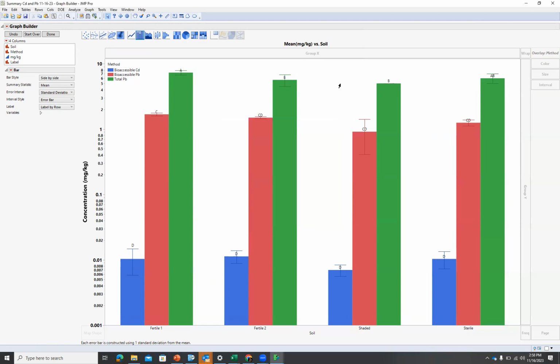You all good? All right. You want the y-axis to have all the numbers, as it'll make it look better. I don't like that too much, but it might help a little, especially for where it says between 1 and 2, because that gives us an idea of the magnitude. If you just do the big numbers, 10, 1, 0.1, 0.01 and so forth, then you miss this, but I think it's okay. If you just have the major ones, it probably looks nicer.